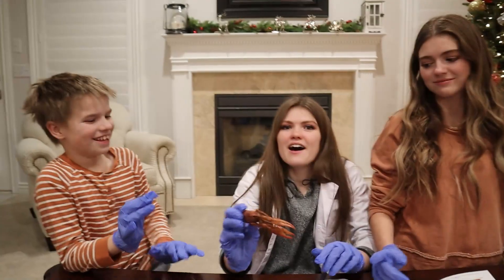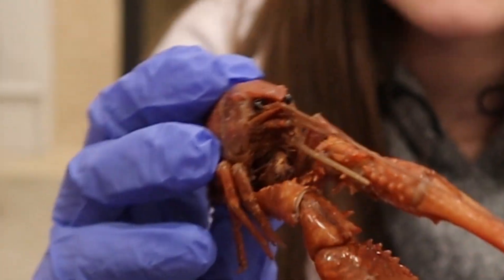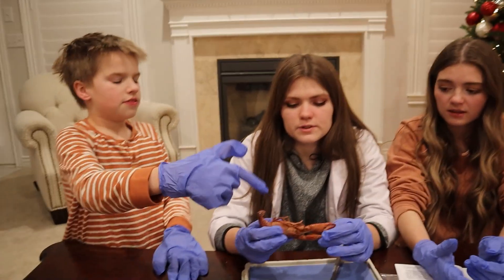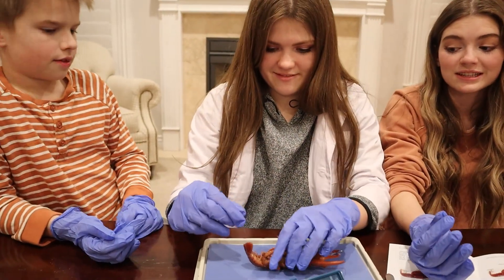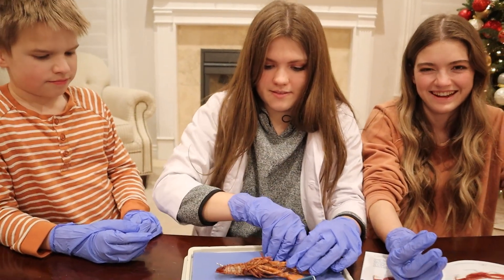Mr. Krabs! Last episode we dissected Squidward, now it's Mr. Krabs! It's losing money! This is all for scientific purposes. We would not do this to any animal if it wasn't for science, and it's already dead. They were gonna do this in normal public school anyway, but since we're doing homeschool this year, we get to dissect at home.